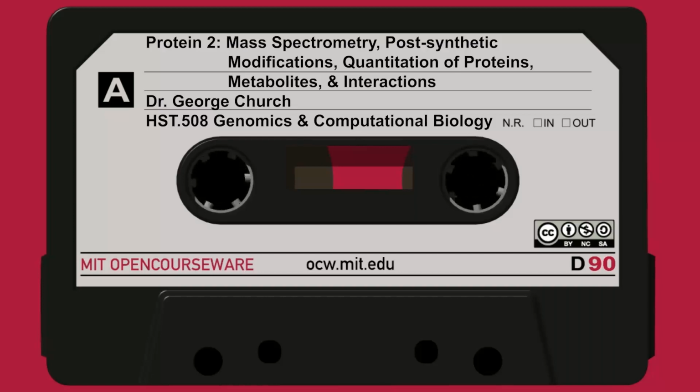Mass spectrometry is commonly applied to peptide masses, sometimes whole protein masses. And here, assuming the mass spectrometer is properly calibrated and so forth, this is a simple isotope sum. And this can be carried out sometimes to 4 or 6 significant figures. And it really is a simple sum of the physics of the isotopes measured by physics. And this can include post-synthetic modifications. As you're getting down to peptides, a post-synthetic modification becomes a much larger fractional effect on the measures that you're making.